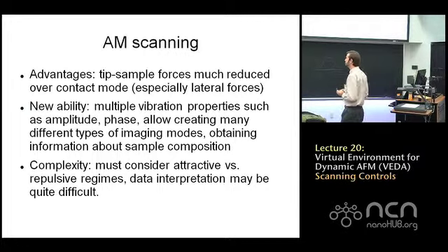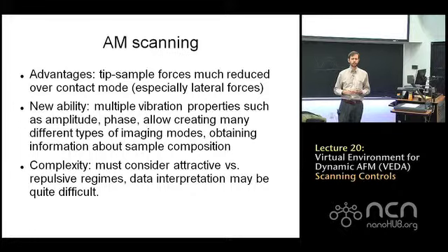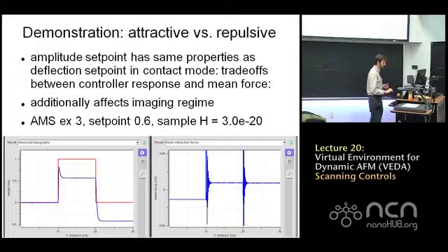However, it becomes much more complex. You now have to consider things like attractive regime scanning versus repulsive regime scanning, and the data interpretation in some cases can be quite difficult. So let's talk about the basic operation of the scanning tool. I'm going to close that one.